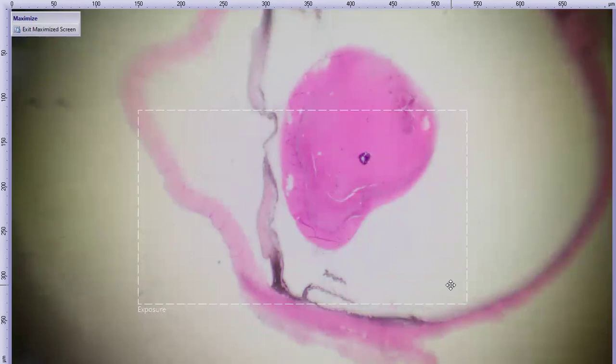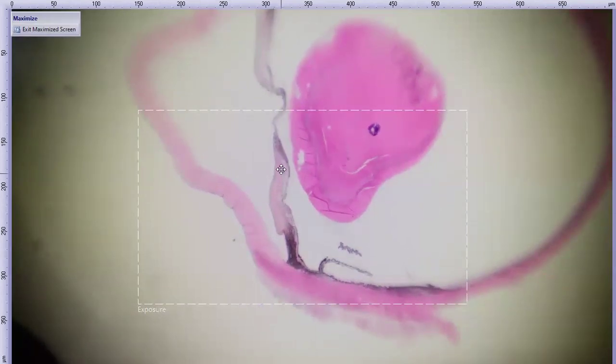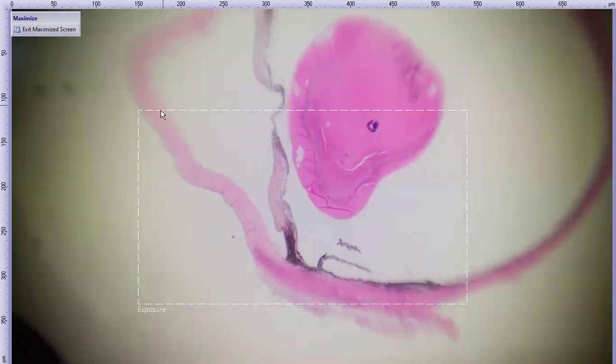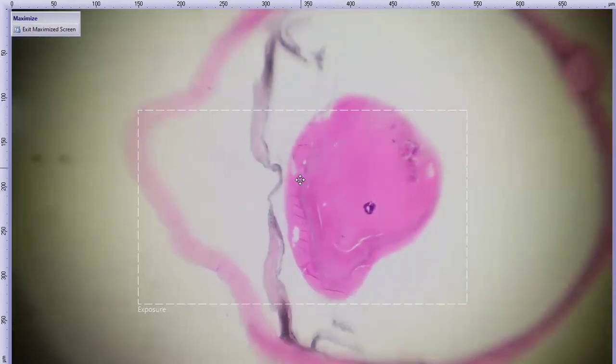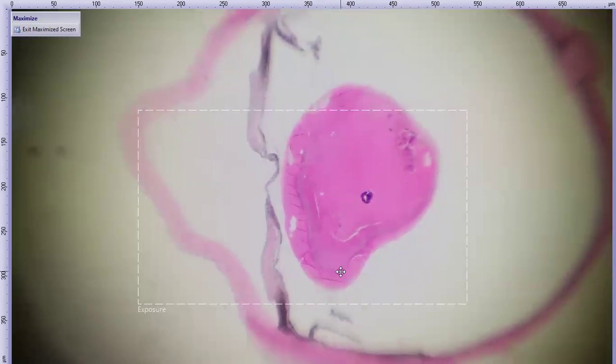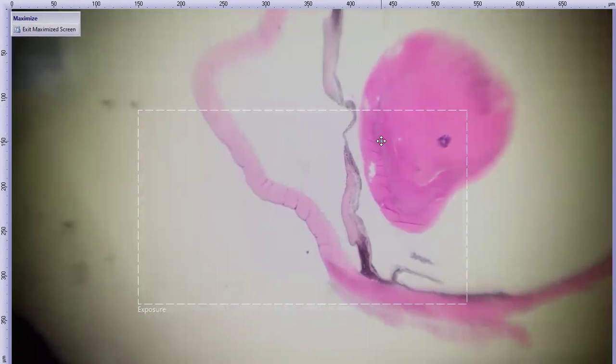So the subgross is actually pretty boring. All right. So what we can see, cornea is off to the left. How old is it again? I'm sorry. 3 years, 5 months. Thanks. Cornea off to the left, optic nerve is back here. Here's the lens. The lens is irregularly shaped and the lens material is irregular as well. So there's our cataract. And then we have iris. We did not quite sample the pupil in this plane of section.